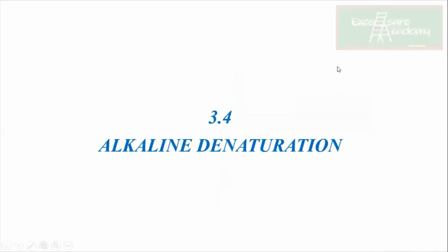Okay. So now coming to the alkaline denaturation. This is mainly used for your plasmid. Okay, so now we are going to see why and how this alkaline denaturation is used for the plasmid.